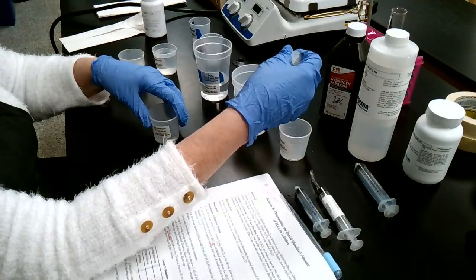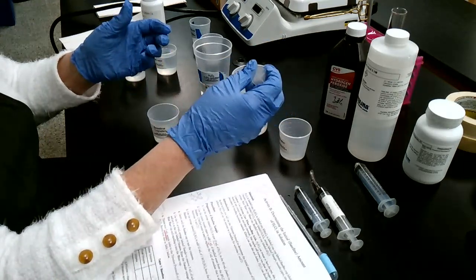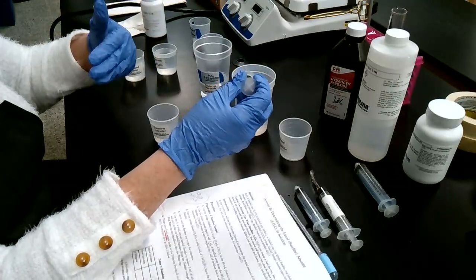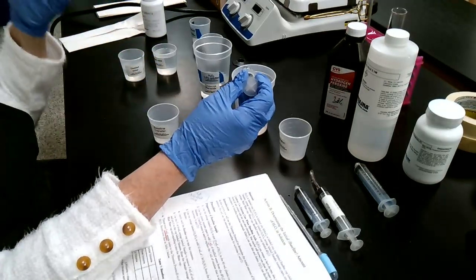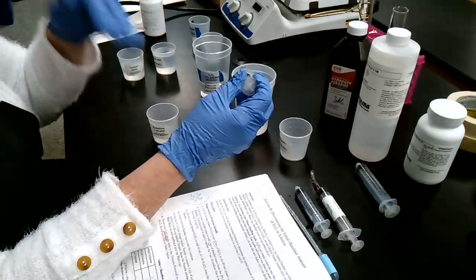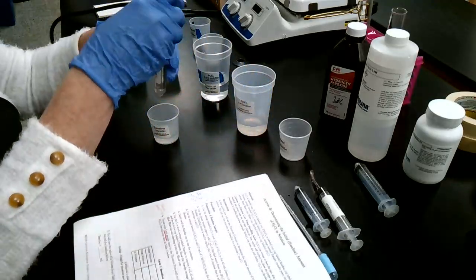Now I can sit here because I did not put catalase in there. I only put water in there, so I know it's not reacting. So why am I even squirting the acid in? Because the acid usually will denature the enzyme and stop the reaction after so many seconds. But I don't have to worry about it because I know I didn't put an enzyme in there. Okay, but I'm still going to put this in as if, okay, that's water that went in. That's our control.